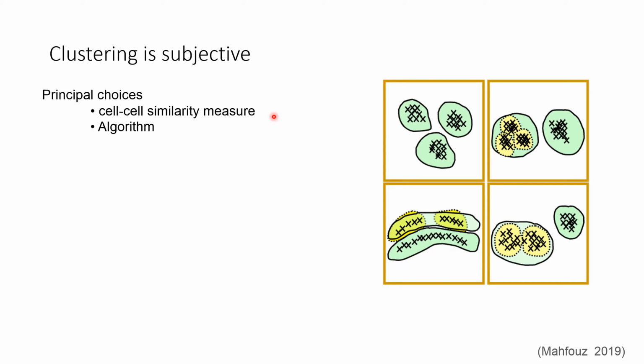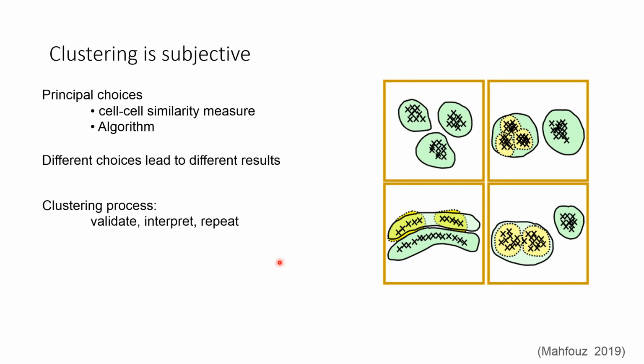But anyway, the current consensus of the field is to perform clustering on a dimensionality reduced set of features using the Euclidean distance. And that's okay because typically clustering is an iterative process. It's performed, a hypothesis is generated by the clustering results, and then it's experimentally evaluated in a physical system.